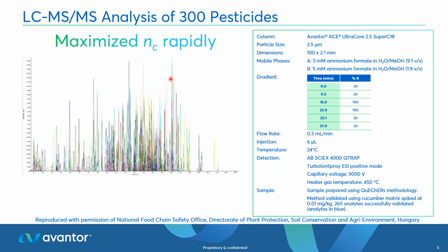In this slide, I'd like to showcase a really excellent chromatogram and illustration of how we as separation scientists can exploit not only the peak capacity of our liquid chromatography separation technique, but also hyphenating that with a high resolution technique, such as mass spec. And when we really do exploit all of the technologies that are accessible to us as scientists, as well as using our knowledge on how to develop a method, not only for the LC, but also the MS, then we can exploit these techniques and obtain these sorts of separations.